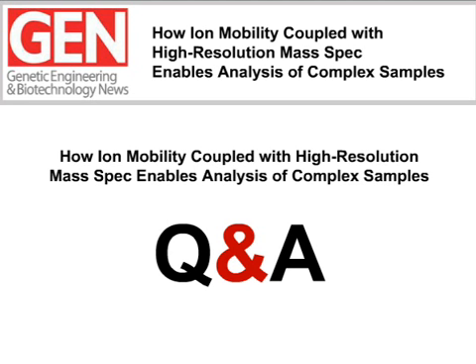Okay, thank you. And we got one more question for John. What sort of dynamic range does the instrumentation have? Sure. The concentration dynamic range in the ion mobility mass spec itself is really about the same as one would get on a mass spectrometer without the ion mobility, simply because we're limited by the detector technology. There have been some advances in that regard.